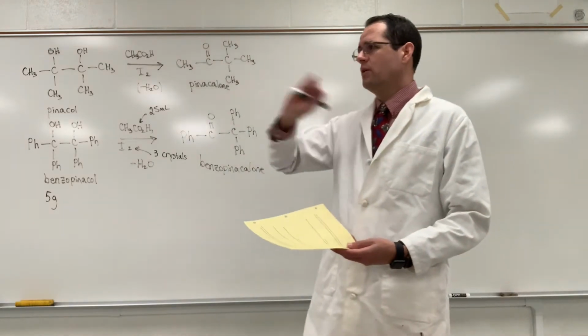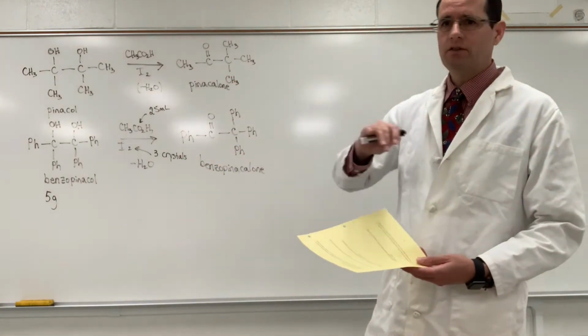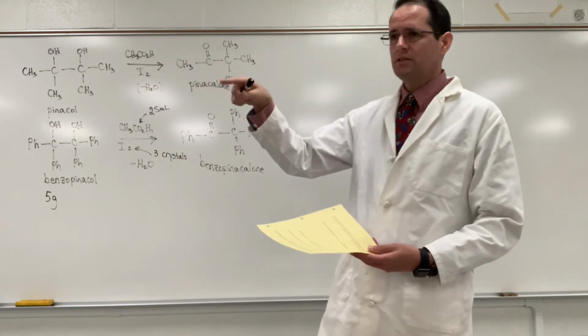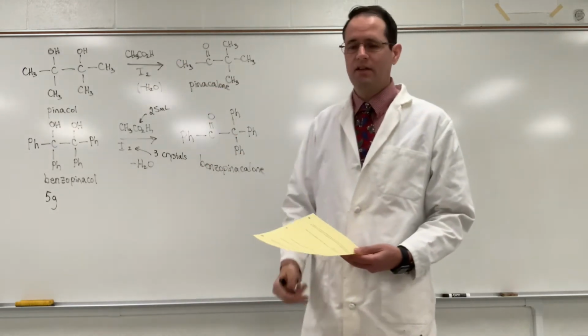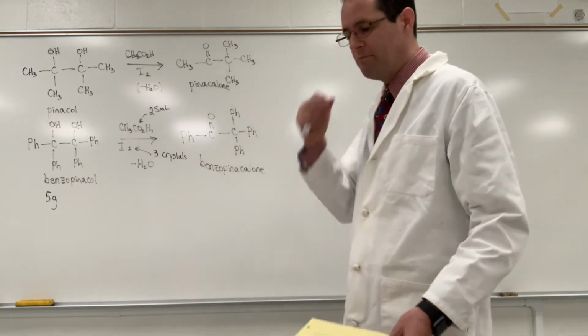I'm just gonna go ahead and pop it in the video so you'll see what your answer should be, but I'm just gonna go ahead and weigh it out, do the math quick on my calculator, and then use the correct amount of acetic acid for the chemical reaction, okay?